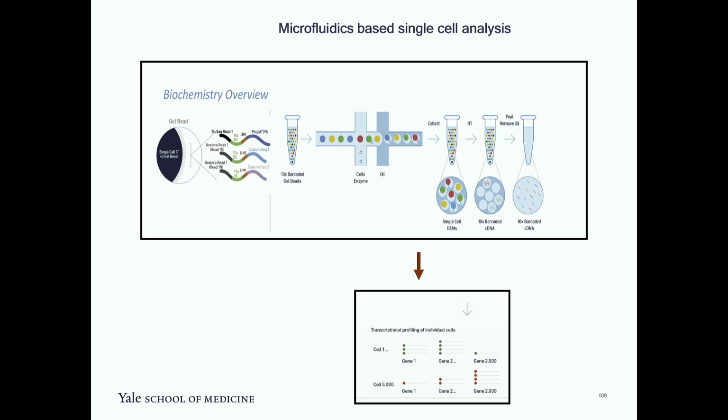But the third thing, which is basically relevant for doublet rate, is that the more cells you analyze, like, say, if you are analyzing 5,000 cells, you will get fewer doublets. But the doublet rate increases exponentially as you analyze more cells per channel. So the doublet rate increases to almost 7% when you are going from 5,000 to 10,000 cells per channel. But then there are bioinformatics ways.